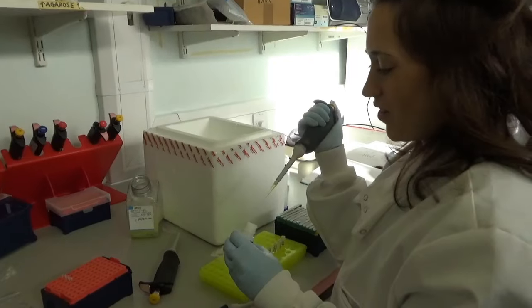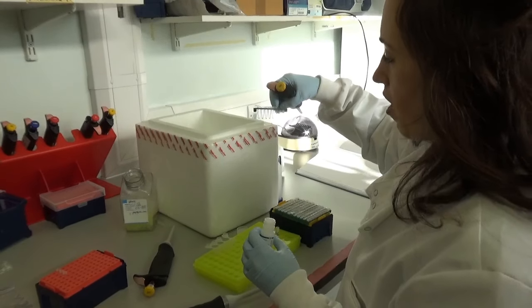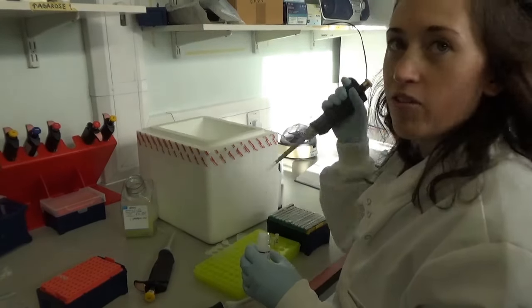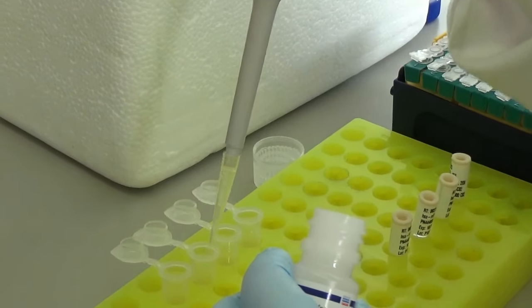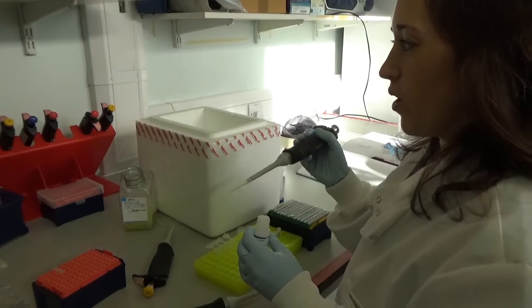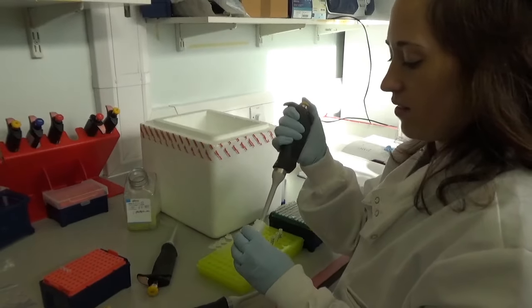Okay, so I'm doing a reverse transcription. That's to reverse transcribe or change my RNA that I've extracted from urine samples from patients into cDNA so that we can measure these things called microRNAs in their urine. So what I'm looking to do is to measure the microRNA changes in patients with diabetes. The aim of that is to predict whether these microRNAs change to better predict whether these diabetic patients will go on to get diabetic kidney disease.